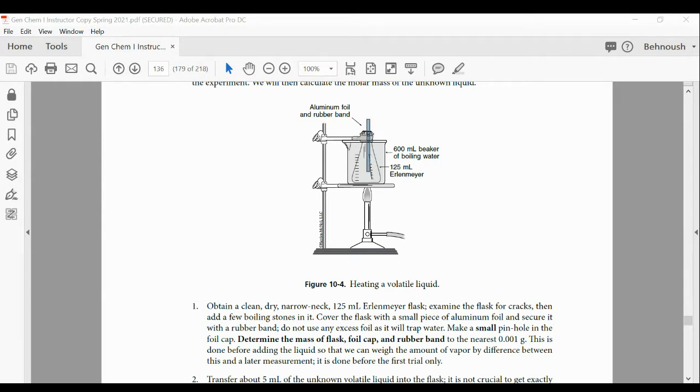Okay, so you now have to measure the temperature. You have to measure because you told me that this chapter has been covered in lecture. So you already know PV equals nRT. And if they give you word problems, you would solve it. When you work in the lab, you have to understand each one of these. You can only have one unknown, which is the number of moles at the beginning. So in order to solve for the number of moles, you must experimentally find the pressure, the temperature, and the volume.